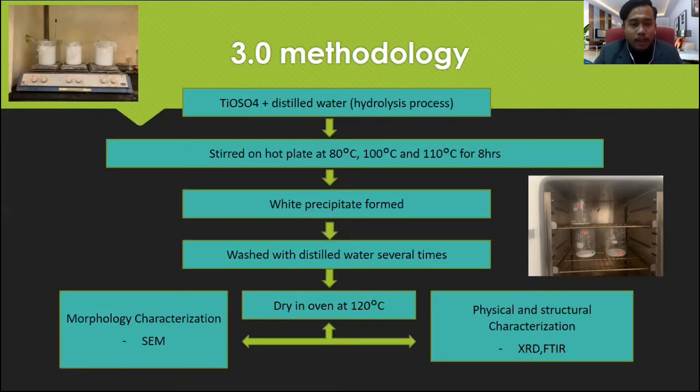After that, the three samples will be added to one more sample of commercialized titanium dioxide powders, and all 4 samples will be sent for the characterization process.